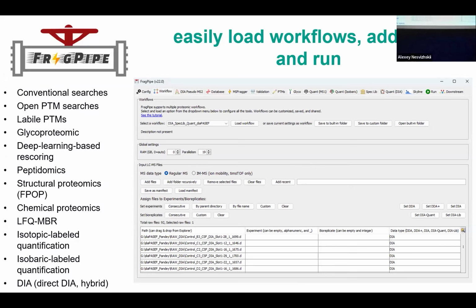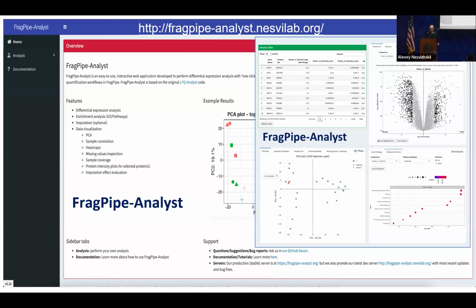And what I'll talk about today are some of the workflows that involve single-cell proteomics data, although the same workflows that we use for single cell, you would use for other data sets as well. We don't actually have single-cell specific workflows because we found that most of the strategies are pretty much the same as for bulk proteomics data analysis, as you'll see from my presentation.